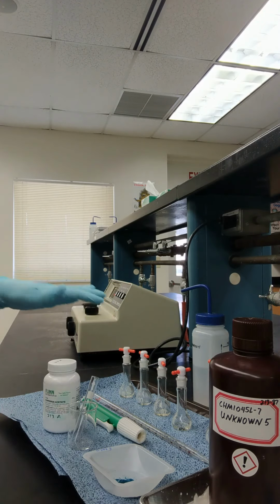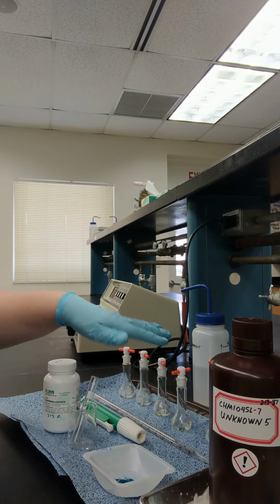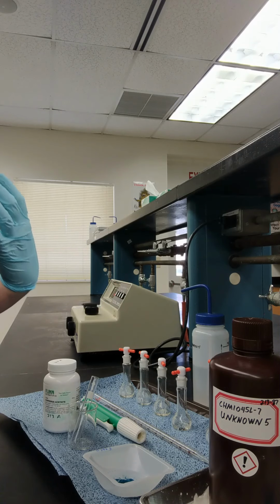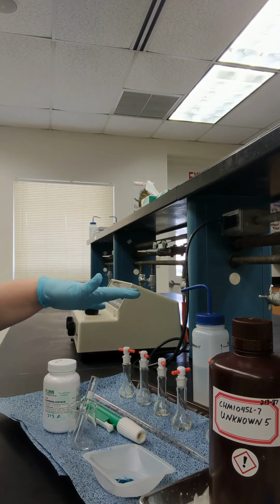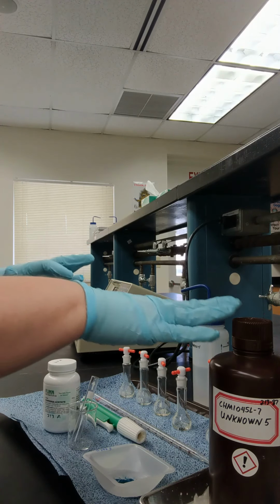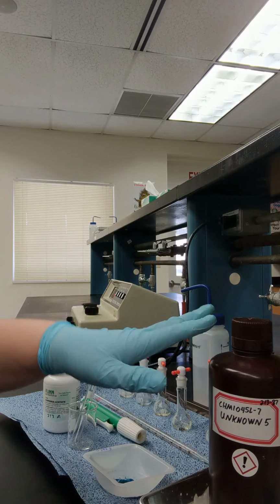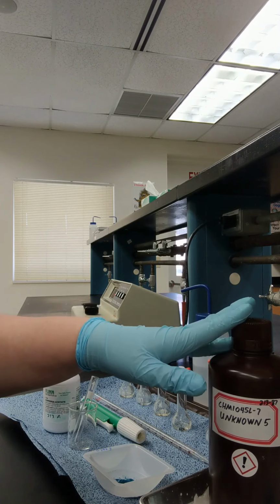So we're preparing four dilutions, or four standards, with known concentration. We can calculate the concentration for these four. This is the unknown, which means that we don't know what concentration of copper we have in this solution.